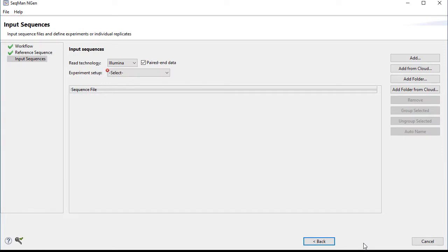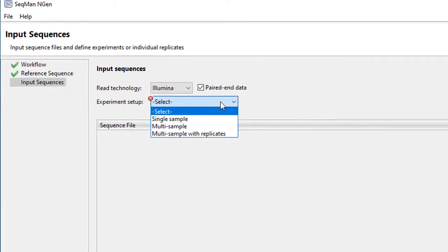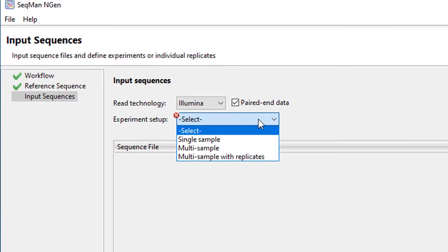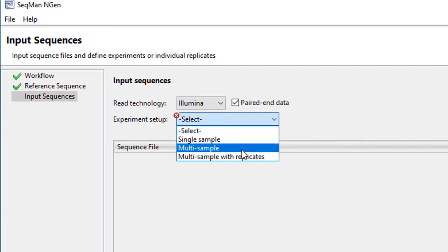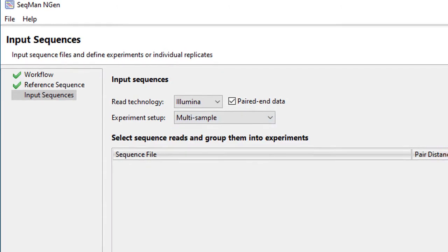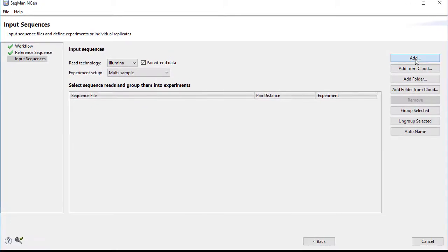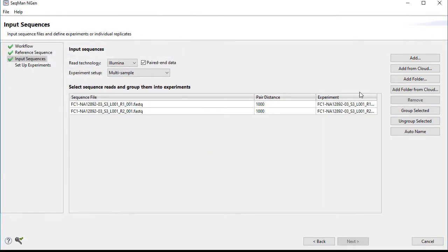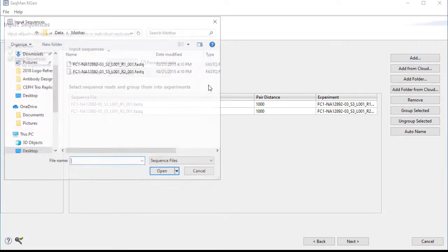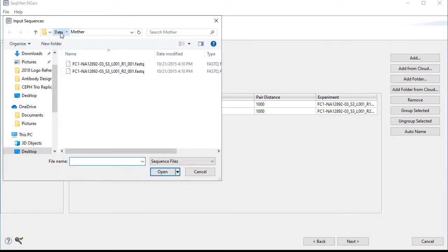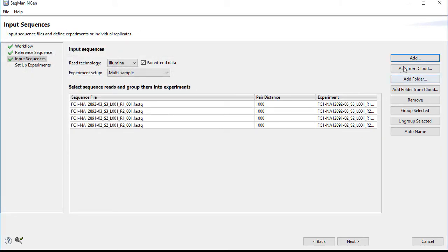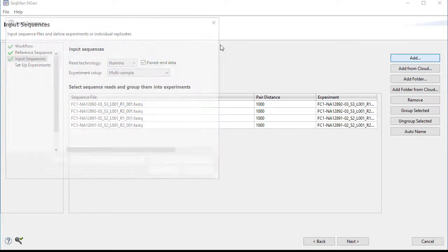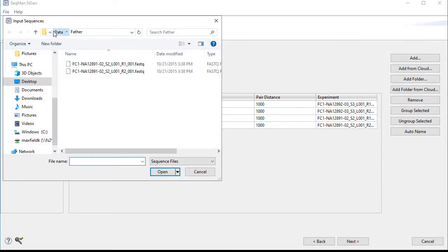Next, import your read data. Here, you can import single samples or multiple samples, and you can also set up replicate sets if you have them. Here, I'm loading FASTQ files from my local computer, but note that you can also load data from your DNA Star Cloud data drive account using the Add from Cloud button.